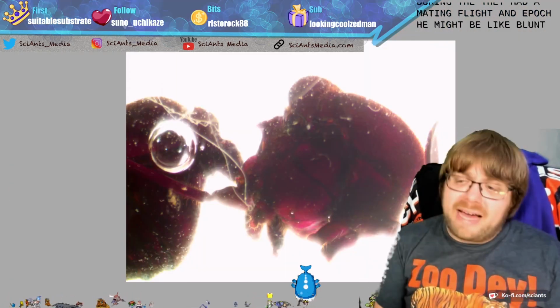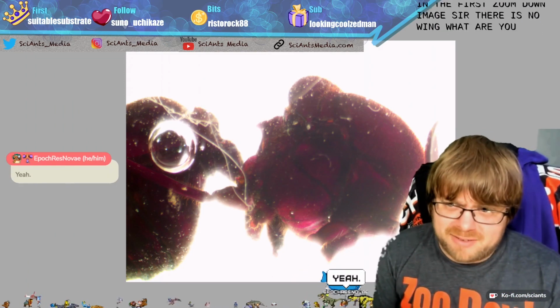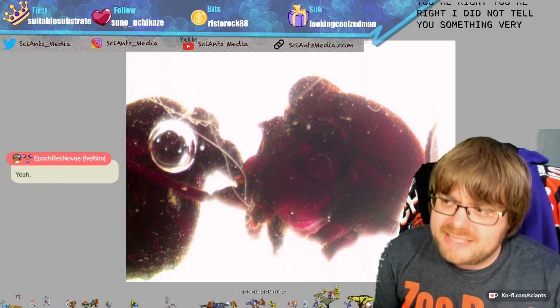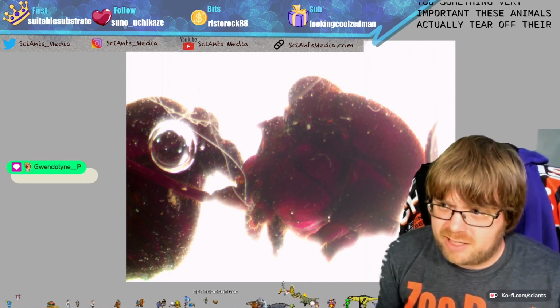in the first zoomed out image, sir, there is no wing. What are you telling me? What are you not telling me? Epoch, you're right. I did not tell you something very important. These animals actually tear off their wings after they've landed.